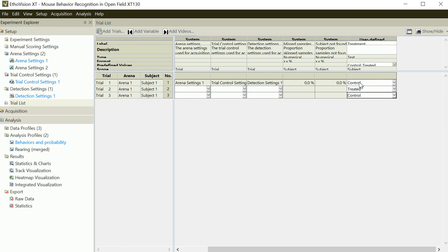Okay, to compare those 2 labels, of course you cannot do this in your free trial, because I am very sorry, I made it wrong. I was wrong. You can do this, even in the 30 days free trial.